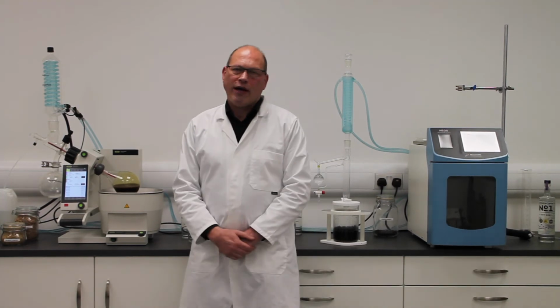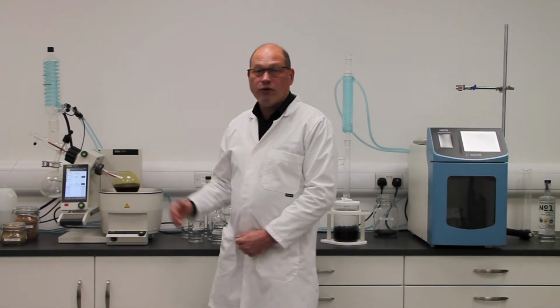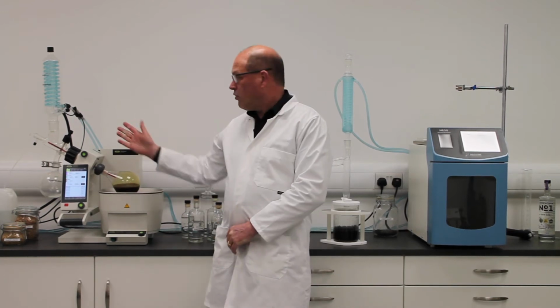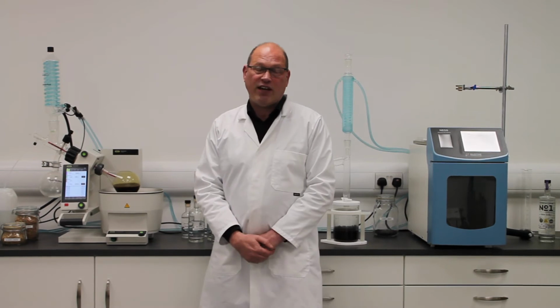Okay, we've talked about the theory of extraction by distillation, and we've talked about the rotary evaporator that we use. Let's cover a specific example.